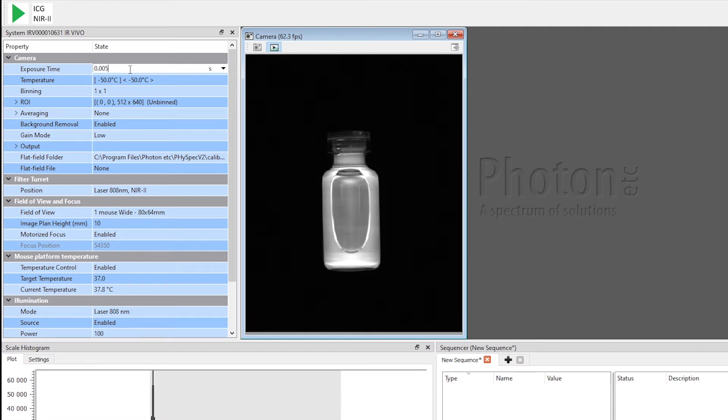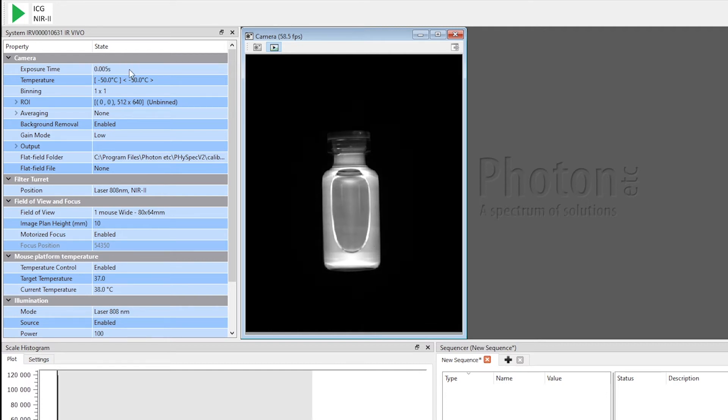To optimize the dynamic range of the camera, I will increase the exposure time to 5 milliseconds. All the parameters are now set for an acquisition. So I will stop the live view, disable the laser, and click on the ICG near-IR button to launch a sequence of operations.